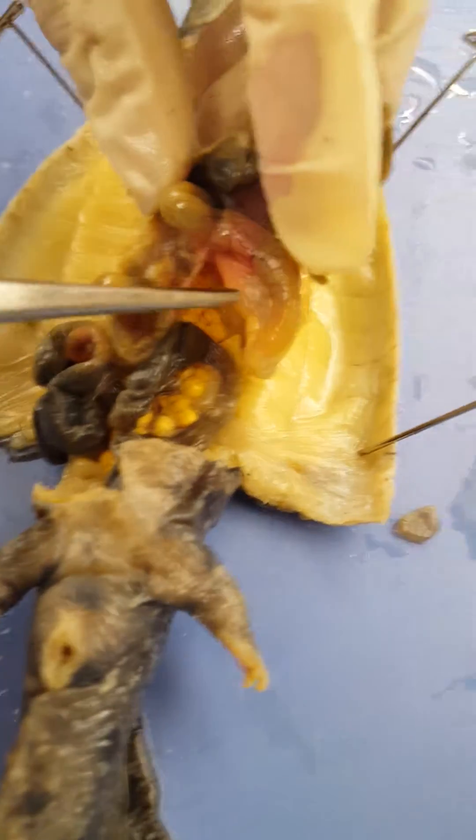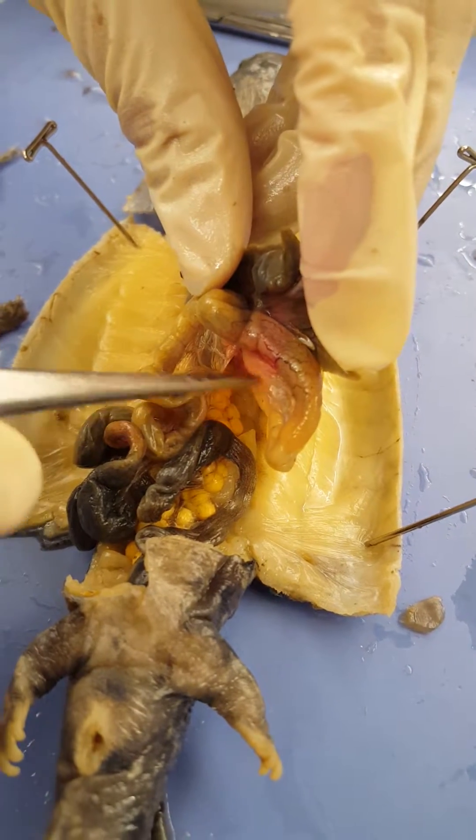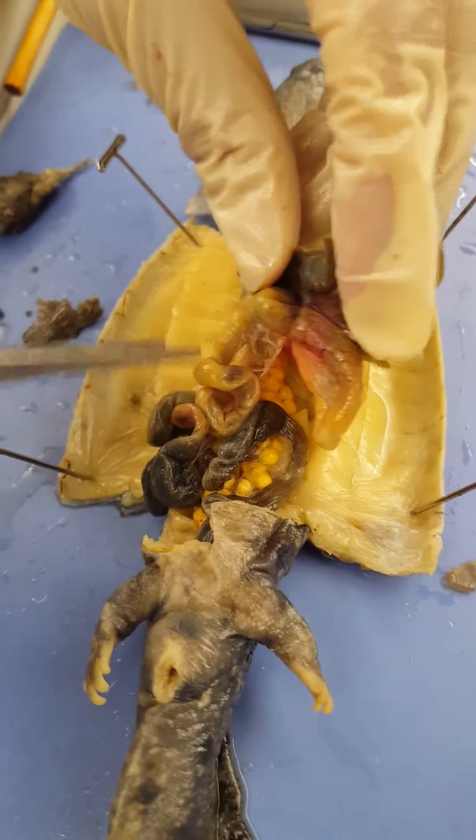Here, attached to the stomach is the pancreas — this red transitioning to a brown structure. The pancreas. Small intestines.